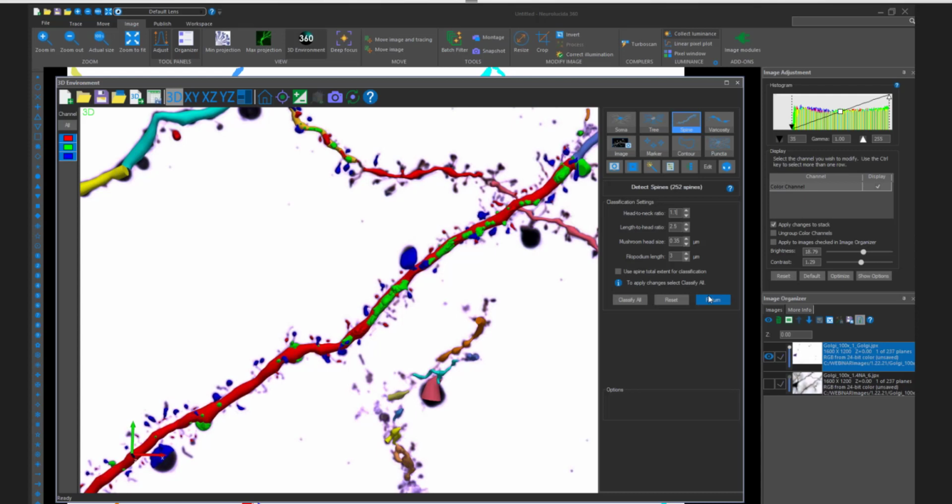And I think I'm allowed to say this, but the interesting thing here is that not only was there a difference between these settings and the settings that we had applied for her, but there was a difference in the scheme between the prefrontal cortex and the hippocampus within those marmoset data reconstructions that she had done.